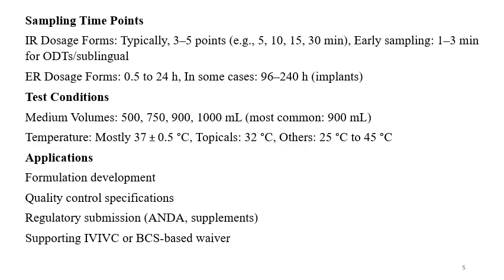Applications include formulation development, quality control, specifications, regulatory submissions, which may be ANDA or supplements, and supporting IVIVC and BCS based biowaivers. So OGD has a wide application, starting from early development till the IVIVC and biowaiver applications. Also for regulatory submission, you can take the help of OGD.